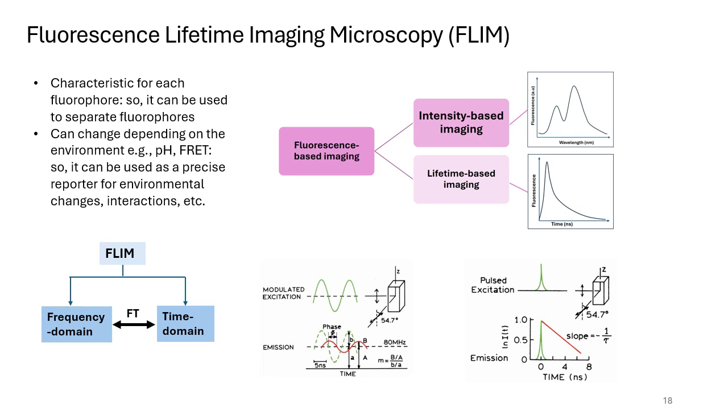So here it is much easier for us to know more about the fluorophore and to know specifically the local environment of the fluorophore. For that, FLIM is a very important technique.